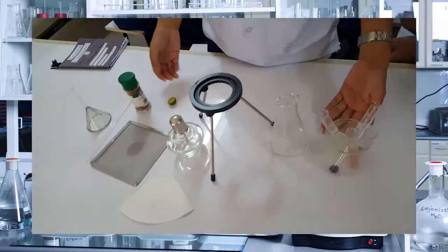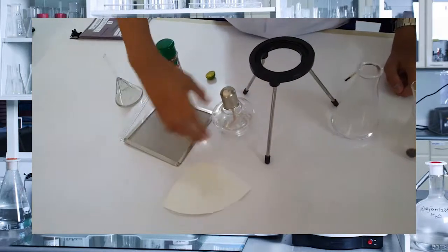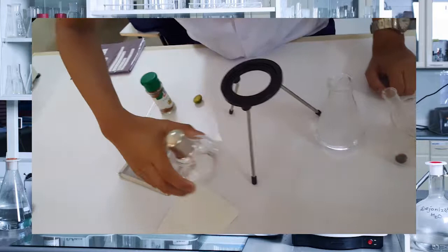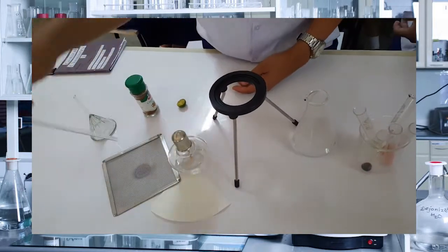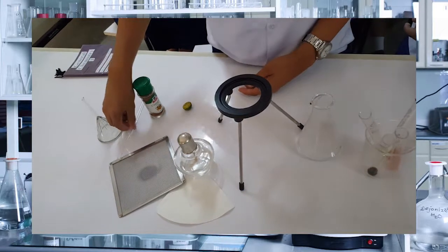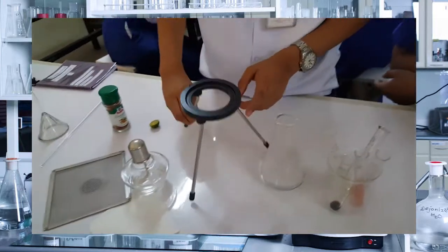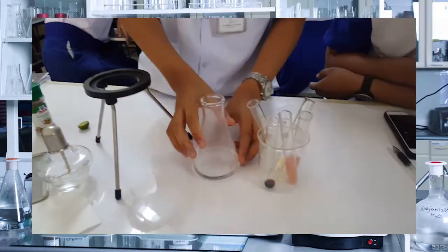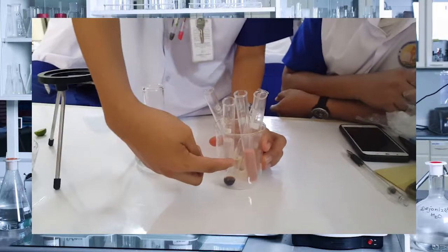So here are the materials that we are going to use. Filter paper, an alcohol lamp, a wire gauze, a stirring rod, funnel, tripod, Erlenmeyer flask, beaker, test tube.